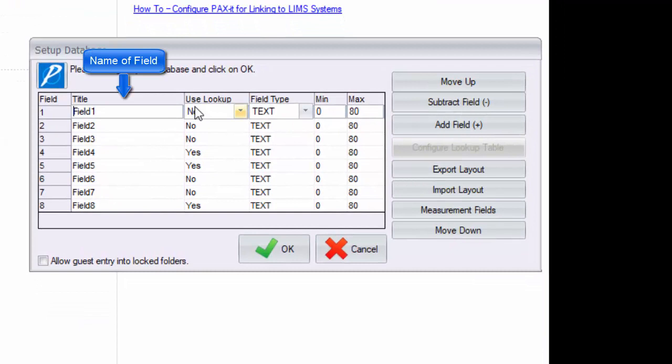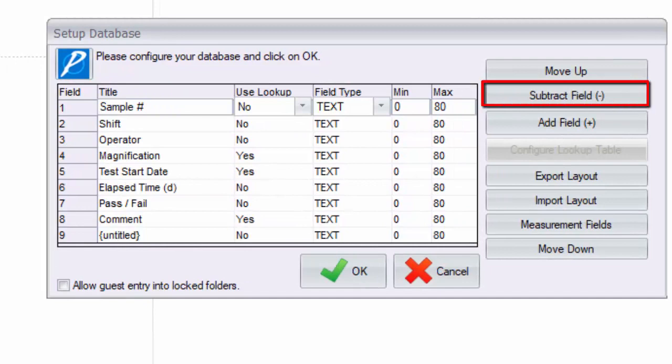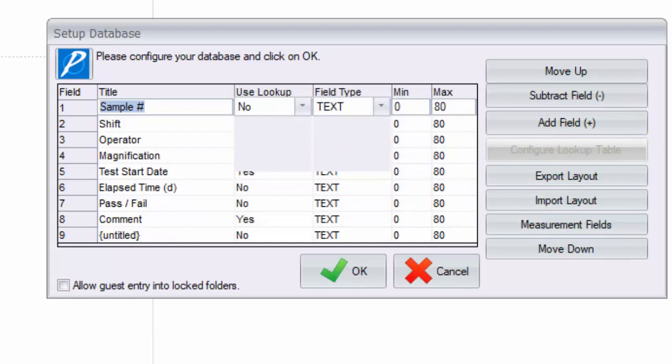Each column in this table has a different function. In the first column we type in the names. This is straightforward and takes the place of the field 1 field 2 labels that are there by default. Note that if you need to add more fields, use the add field button. And if you don't need to use all of the default fields, you can subtract from the end of the list with the subtract field button.